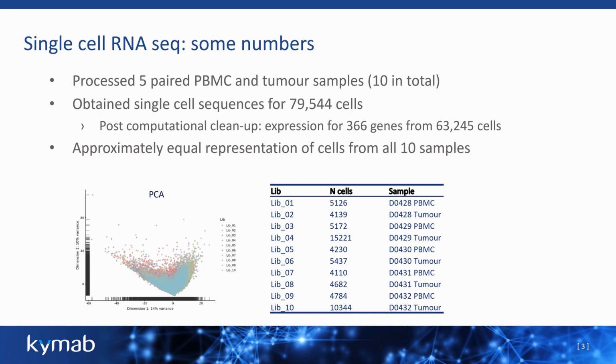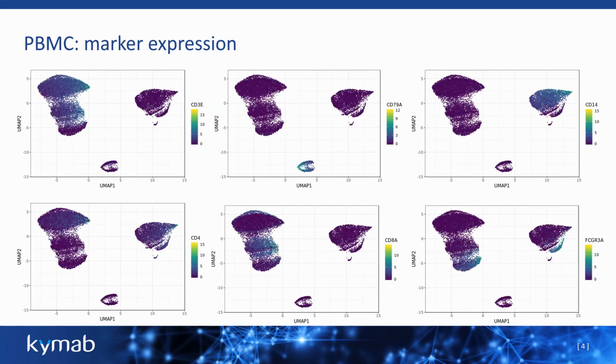You can see that basically the samples roughly sit on top of each other, which is a good QC to tell us that we've removed the major batch effects, and that what we're dealing with in terms of the differences in gene expression is due to the biology of these samples. But obviously one thing you can see from the PCA plots is that you can't really see differences in cell types. So for that you need to turn to different computational approaches.